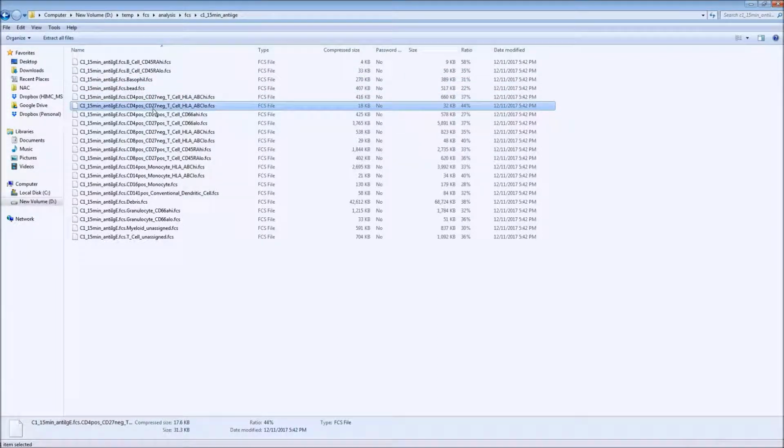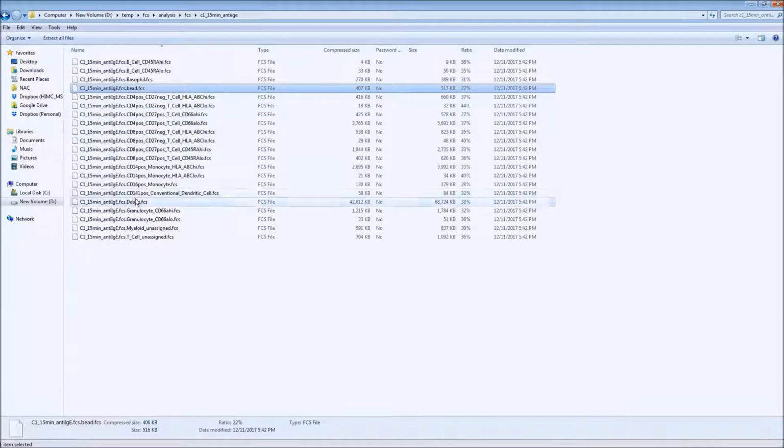These subsets correspond to the profiling level as described in the Immunophenotyping Navigator tutorial. Therefore, they cover both the manually curated hierarchy and the following data-driven separation. In addition to cell subsets, this directory has the bead and debris files, which include events that Astrolabe removed from its analysis.